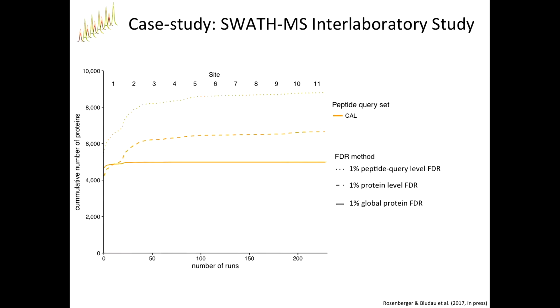Alexei will, I think, talk tomorrow, and he's generally of the opinion that if you have a data set that has a lot of peptides in there, you should also look for all of them. And then I think what Mike's been saying more is that when you have a few peptides you're interested in, it's totally sufficient to look for those. You definitely still have to have enough peptides to make your model, but then you're done, right? So I would say maybe 100 or so. Do you agree?